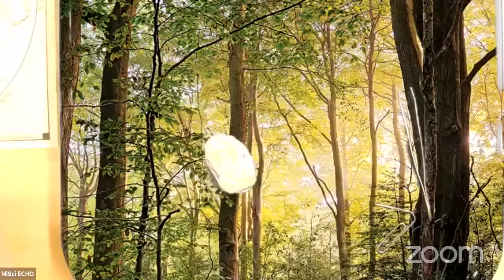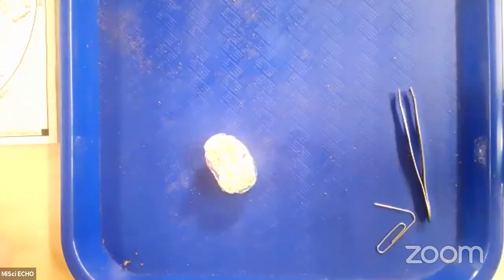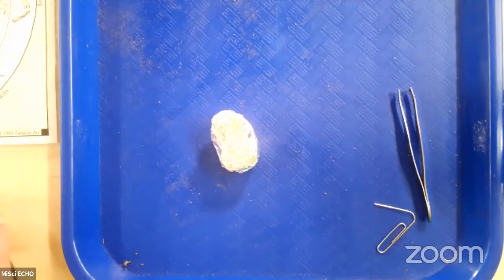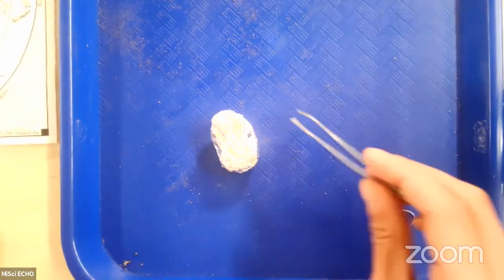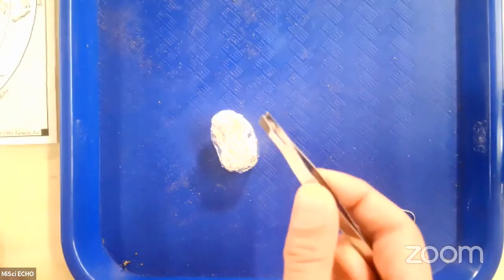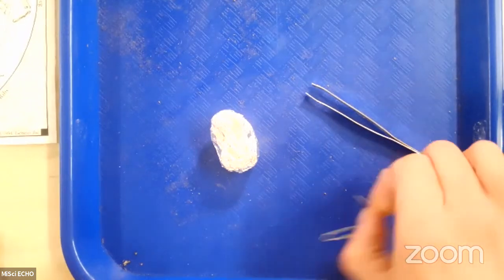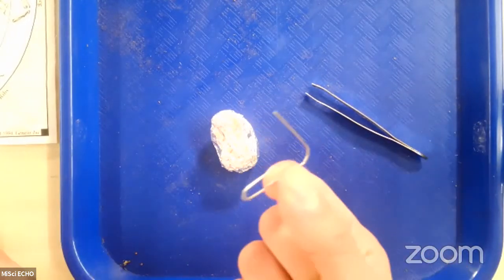All right, so let's switch our camera over here to our document camera so that we can take an up-close look at this dissection. And just like with our flower dissection, we really don't need very many tools for this type of dissection. But you can see that I've got my little tinfoil wrapped owl pellet right here on the tray. And we're going to be dissecting it using just two things. So I've got some tweezers here, which is going to help me to extract some of those furry pieces of our owl pellet, leaving the bones behind. And then I also have an unwound paper clip, and you'll see why this is really important.